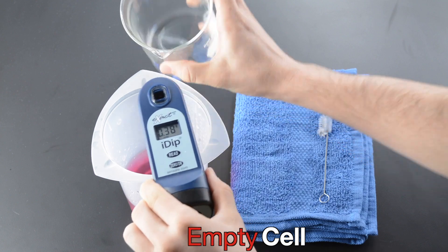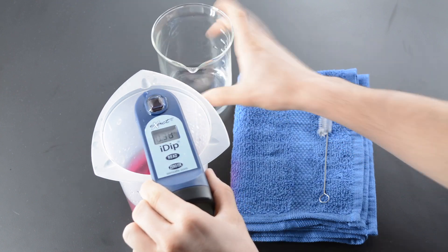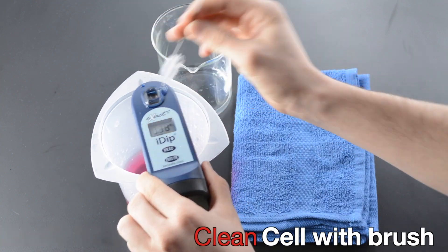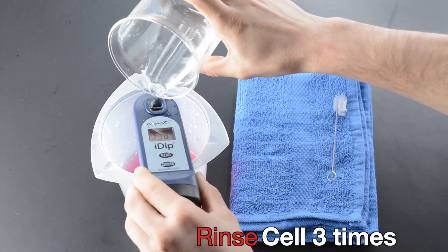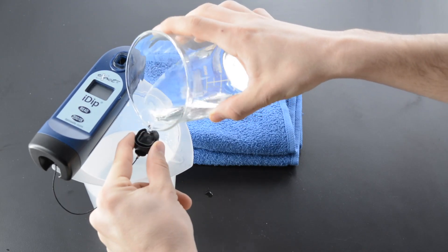Empty cell. Clean cell with brush. Rinse cell three times. Rinse cap three times.